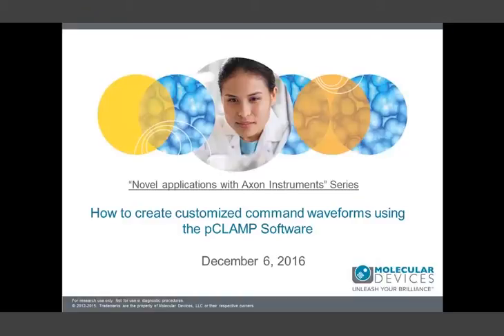Today we have Jeffery Tang to talk about how to create customized command waveforms using pCLAMP software. My name is Jeffrey Weber and I'm the Product Manager for Electrophysiology at Molecular Devices. I'm very excited to introduce my colleague, Dr. Jeffery Tang from Molecular Devices. Dr. Tang will be highlighting using pCLAMP to create customized command waveforms, and then we will open up the floor for questions and answers.